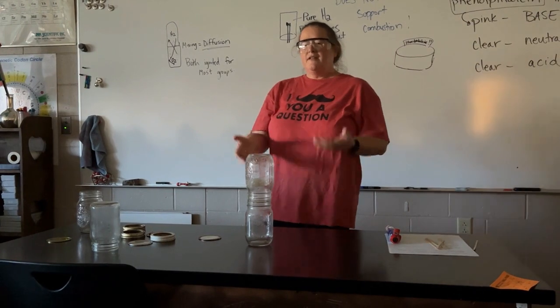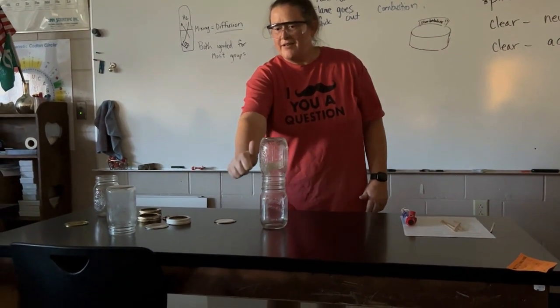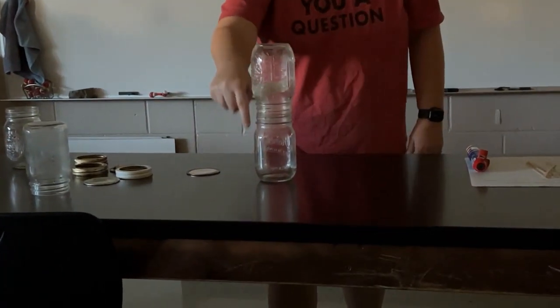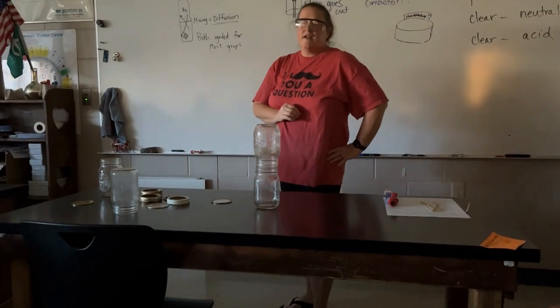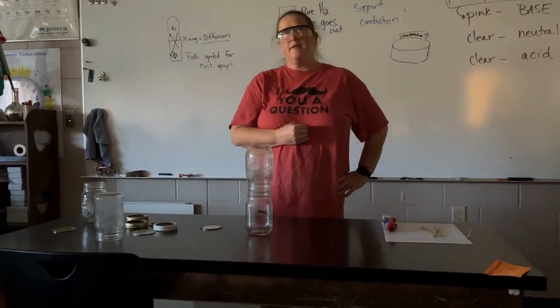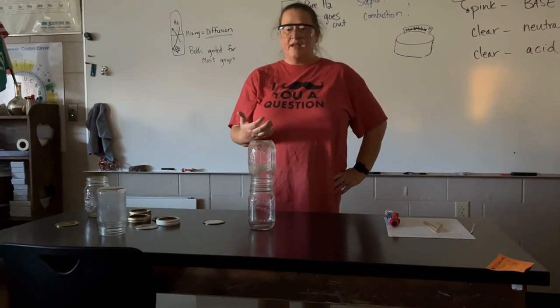Now, hydrogen is less dense than air. It's going to have a tendency to stick around in this jar. Oxygen is more dense than air. It's going to have a tendency to stick around in this jar. What I'm hoping to show you in this demonstration is the ability of each of these gases to diffuse.